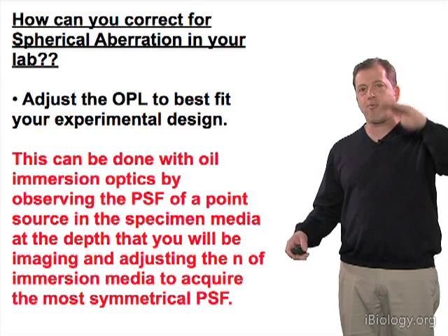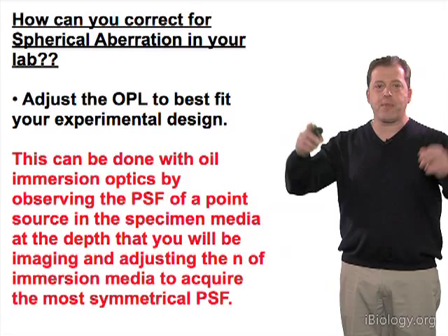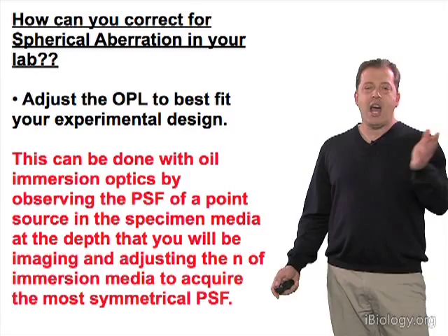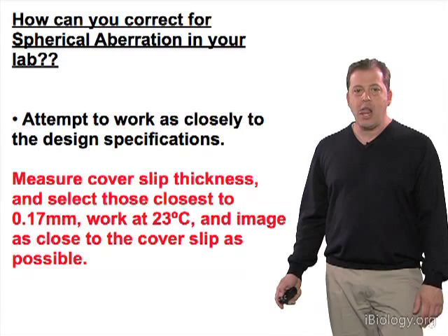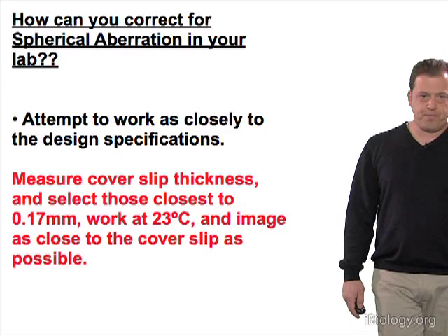The best correction is found when, focusing through up and down, you have the best symmetry of in and out of focus light. You can use immersion media to correct for spherical aberration, and oftentimes that works pretty well, though it's a bit tedious and can be a little messy.